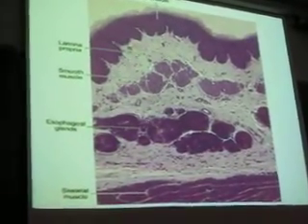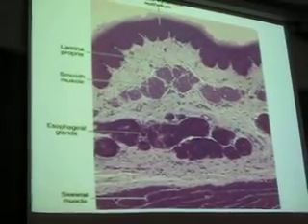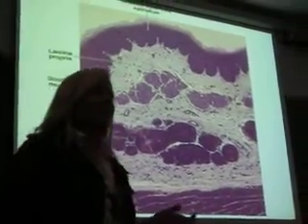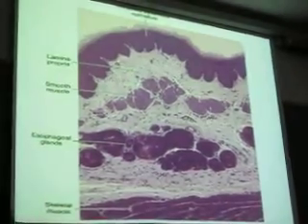Esophagus? Stop. Gland. Oh, dang! Okay, I wish it was that good. If you didn't see that, what else would you look for to tell me where it's going to take you? See skeletal muscle? Sure. What else?